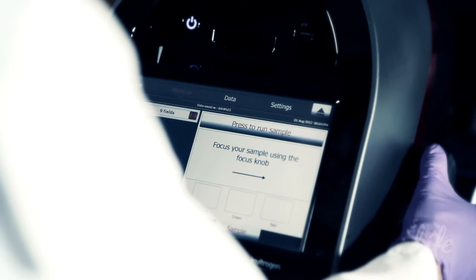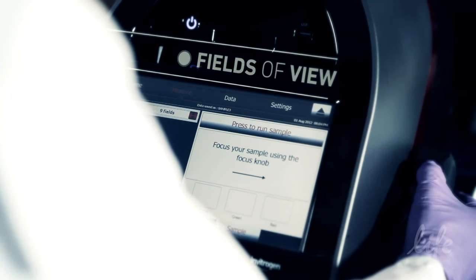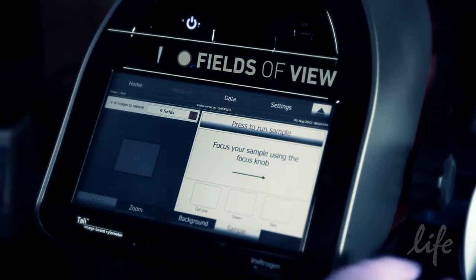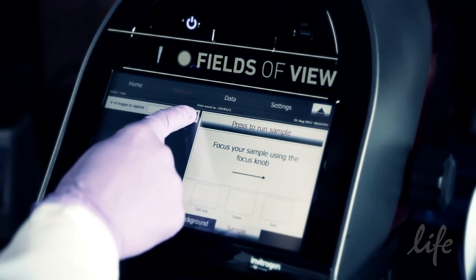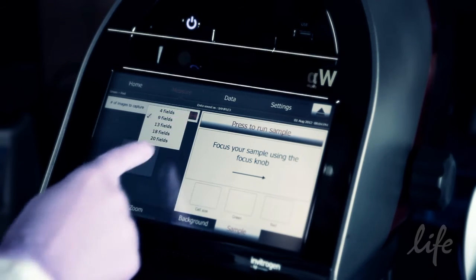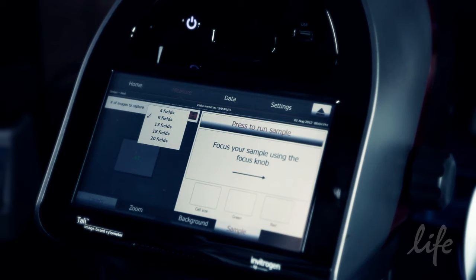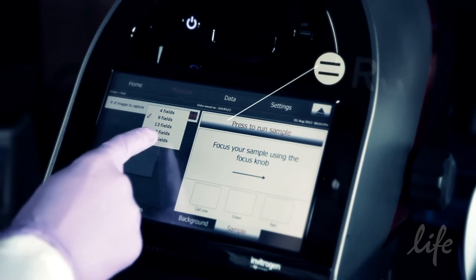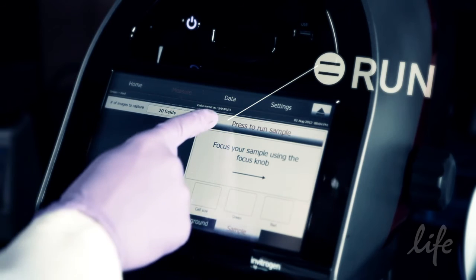To specify the number of fields of view to capture, touch the arrow button on the Number of images to capture drop-down menu and select from the available options. The more fields of view analysed, the more powerful the statistical analysis. Touch press to run sample to start the analysis.